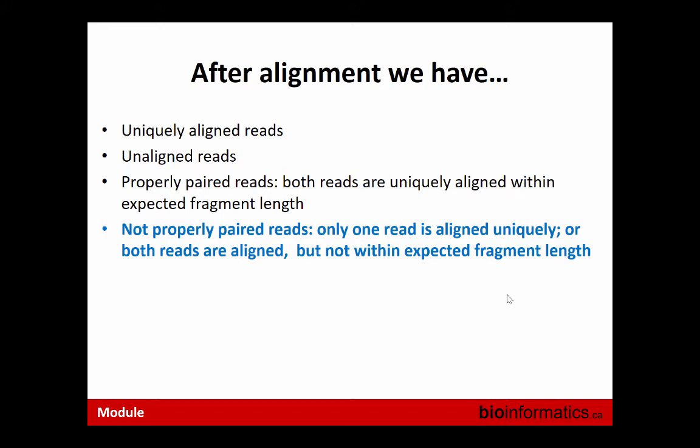However, placement of reads on different chromosomes can be also a reflection of translocations. If we have data coming from transformed genome, it can be true situations that we have pair end reads spanning a region of the genome where translocation happens. Our reference doesn't have this, but when the real sample has it, and when we place our reads into the reference, reads end up in completely different places of the genome. So this is interesting, for some of you it can be interesting because it can be very relevant to the research project.